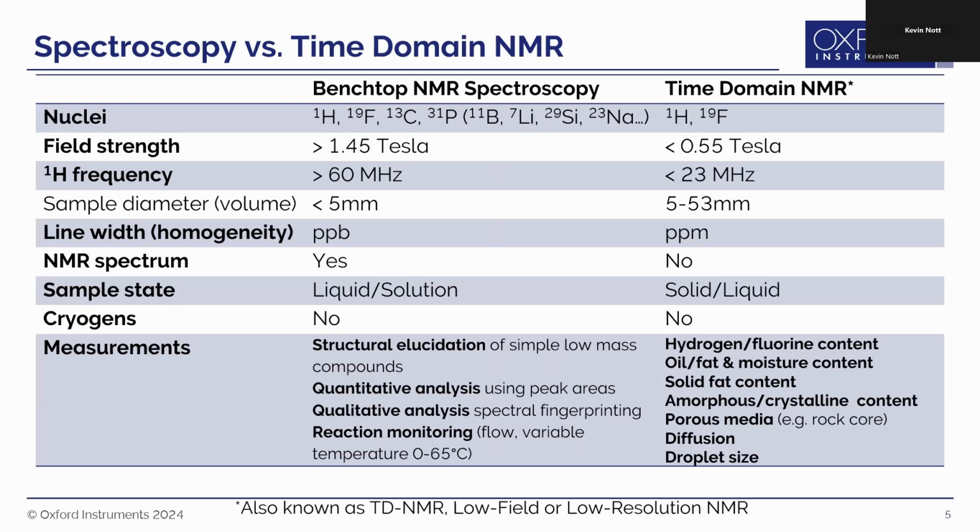Another advantage of using TD-NMR is to measure a variety of samples, whether they be solid, liquid, powders, or paste. Also, typically, we don't need to change or destroy the sample. We can measure inside samples and processes non-invasively, or better still, measure samples inside the glass or plastic container without opening, even if it has an aluminium cap.